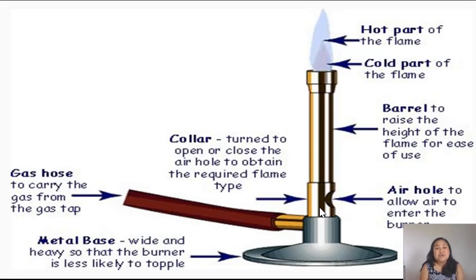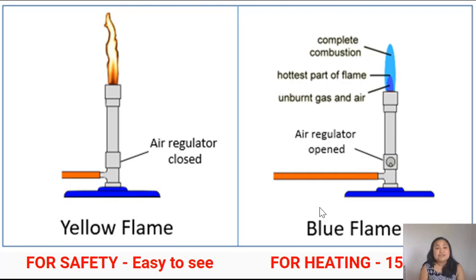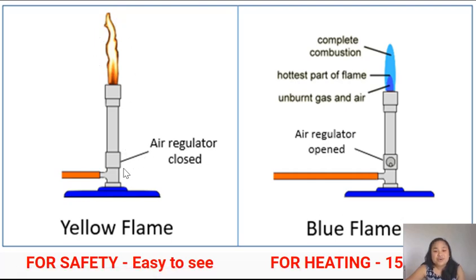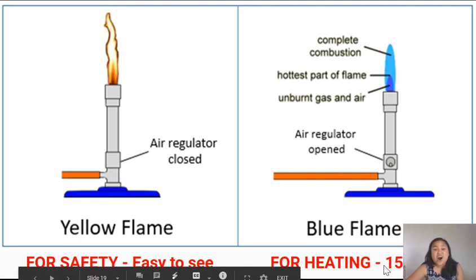Ms. Adviento will show you these different parts on a real Bunsen burner. The Bunsen burner can produce two flames: the yellow flame and the blue flame. When the air hole is closed, the flame will be yellow. This yellow safety flame is easy to see, so whenever you're not heating anything, always close the air hole. When the air hole is open, the Bunsen burner produces a blue heating flame, which is extremely hot and hard to see, and can cause serious burns. The hottest part of the flame is about 1500 degrees Celsius — hotter than the temperature needed to melt silver and gold.